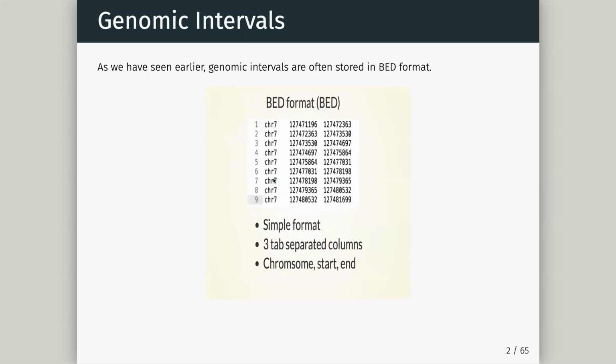So here, really, how we represent genomic intervals is files. We just use a bed file. The simplest bed file we can see or use is just three tab-separated columns. We have the chromosome name, tab-separated start, tab-separated end. And this would be an interval, this first region here. It's also a genomic interval because it's got a chromosome. So we know something happened or something of interest on this chromosome within this region.